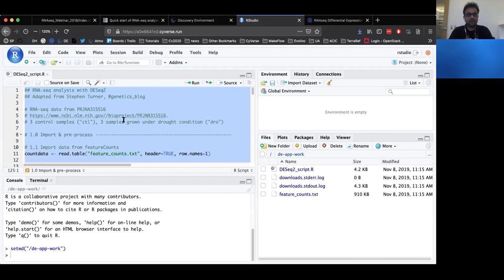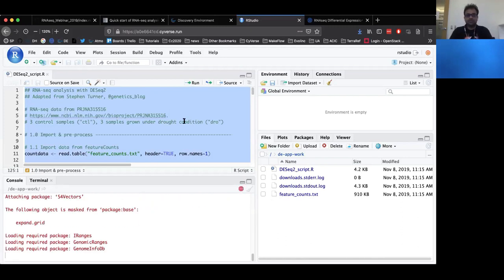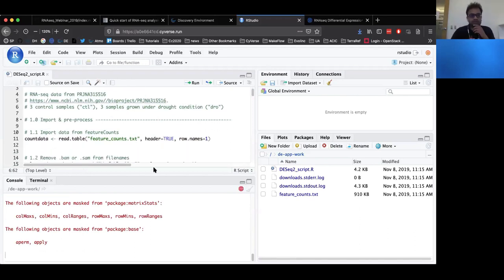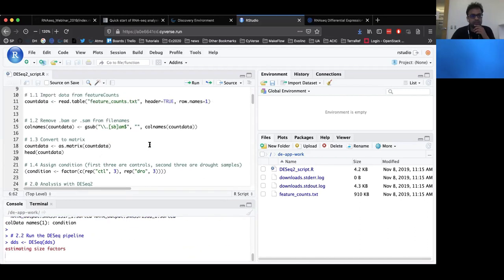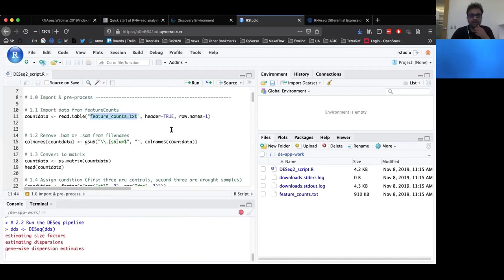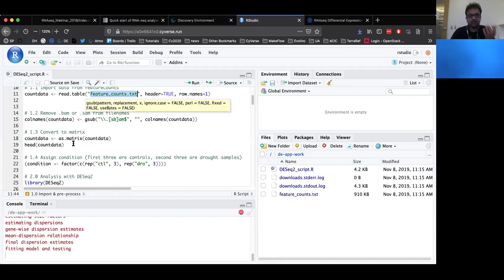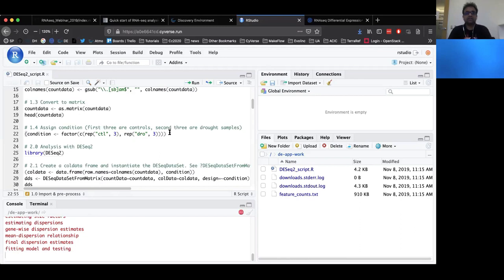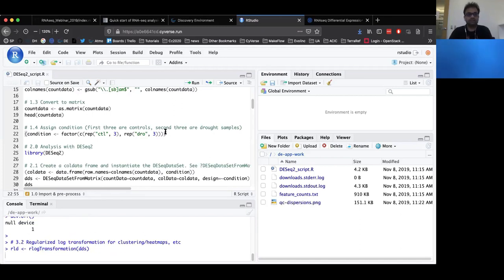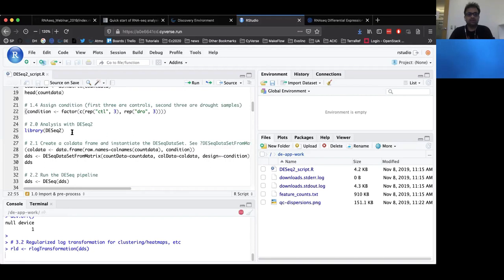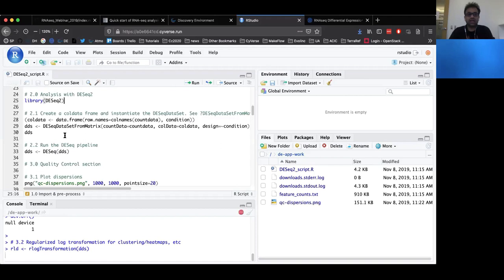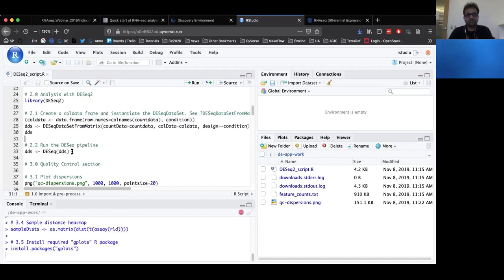You can see the script is running. In this script, the first section is about importing the data — I'm reading in the feature counts file that we loaded into the app, doing a bit of housekeeping to make the tables nicer and convert them to a matrix. Then we are assigning a condition for our differential expression analysis. In this case, we are comparing drought condition against control samples, with three replicates for each. Once we have imported the data, the next step is to load the DESeq2 package and create a DESeq2 object. Once the DESeq2 object is created, we run the DESeq2 pipeline, which undergoes steps of normalization, dispersion estimate calculation, scaling factor estimation, and computing log fold change values, finally giving us the differential expression results.